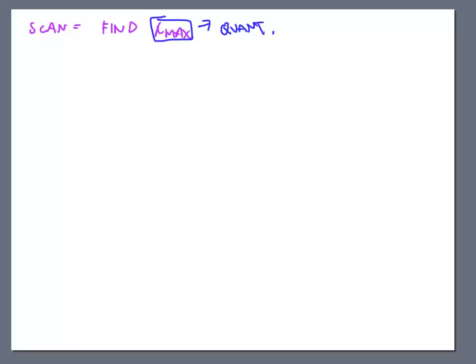Okay, so after I scan, that's kind of step number one. Step number two, I then go into the go-to feature. And if it's not listed as a go-to, sometimes it's called the fixed application. So, go-to or fixed, it's one or the other. On our Thermo units, I believe, use the word fixed. So the point of the fixed application is it will want you to type in the lambda max.